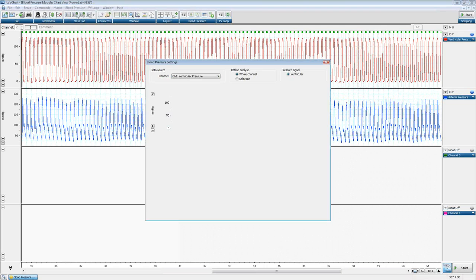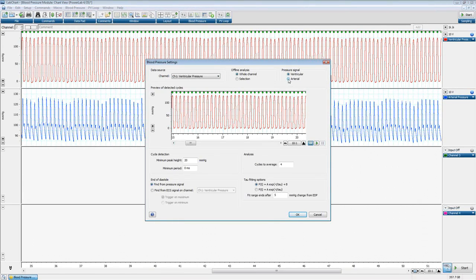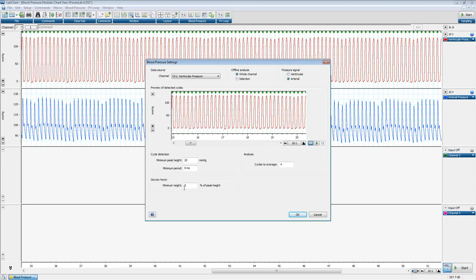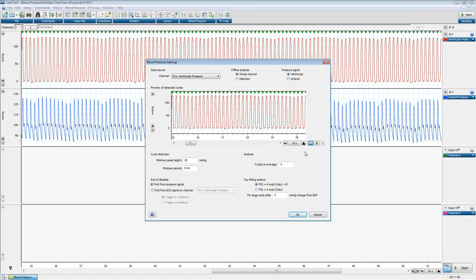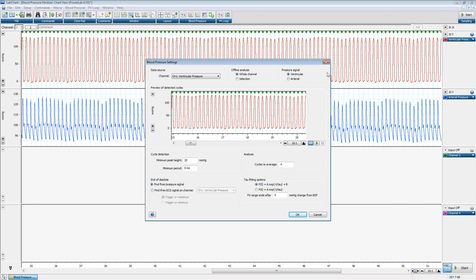If I go back to Settings and choose arterial data, the options change — we can now look for the dicrotic notch, and set its minimum height as 5% of the peak height for the algorithm to detect it. For our specific file though, we'll go back to ventricular. The same things apply with arterial analysis, so we don't need to do a separate demonstration there.